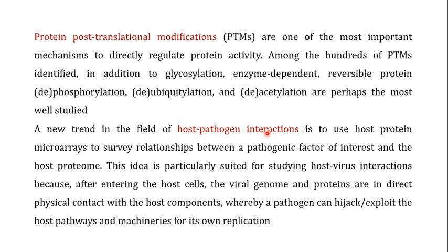Now, a new trend in the field of host-pathogen interaction is to use host protein microarrays to survey the relationship between the pathogenic factor of interest and the host proteome. This kind of host-pathogen interaction is very important, especially in host-virus interactions, because after entering the host cell, the viral genome and proteins are in direct physical contact with the host components, whereby a pathogen can hijack or exploit the host pathways and machineries for its own replication.